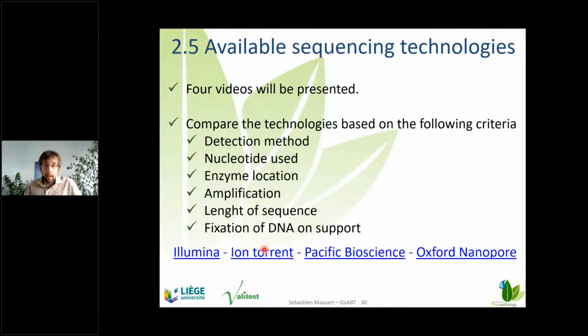There was the possibility to share four videos with you, but I just put it here, and we will send you a link to these videos if you want an overview of the four main current technologies. The idea is to compare these technologies a little bit based on the detection method used, the nucleotides used, the enzyme location, amplification, and so on. We will not go into details there, but you will receive the link.